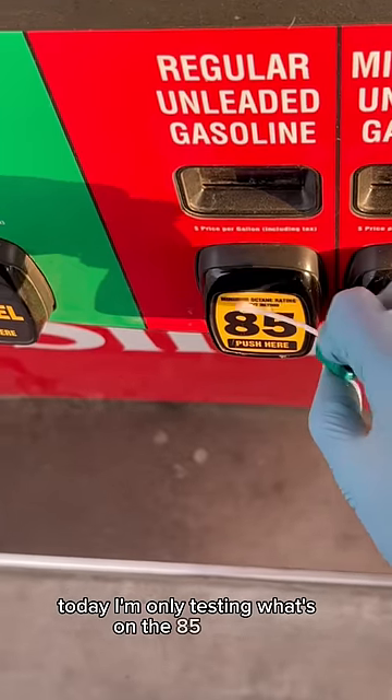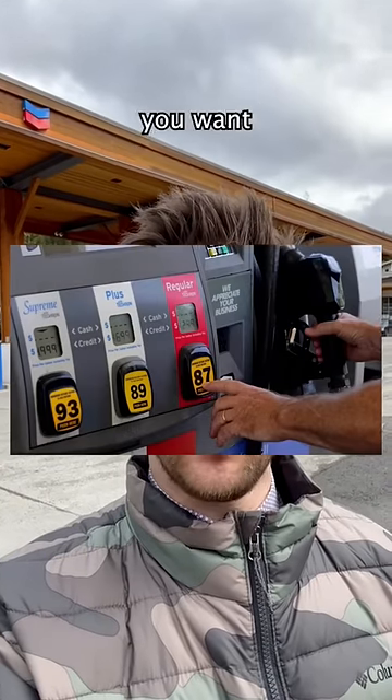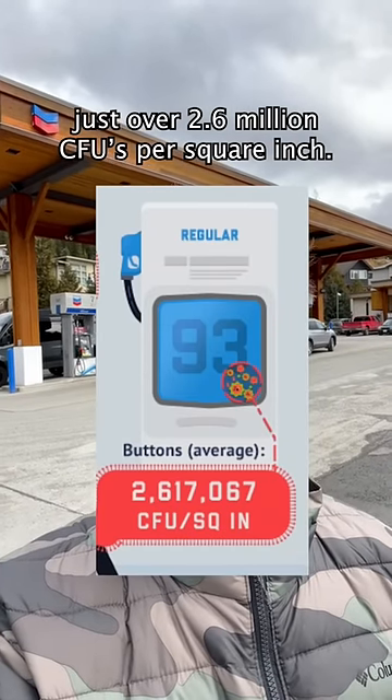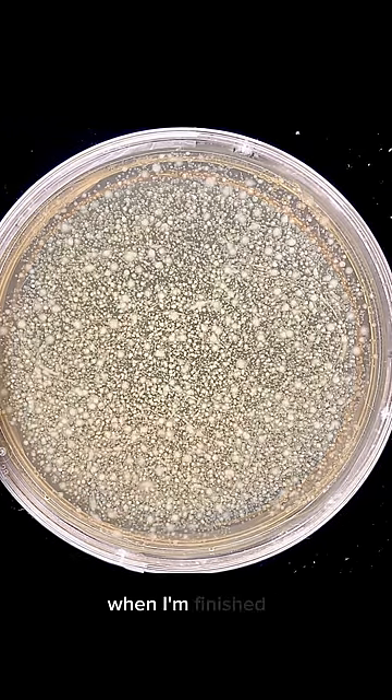Today, I'm only testing what's on the 85 button, and the buttons on the pump where you select the grade of gas you want had an average of just over 2.6 million CFUs per square inch. Now if that's true, the Petri dish will look something like this when I'm finished with my test.